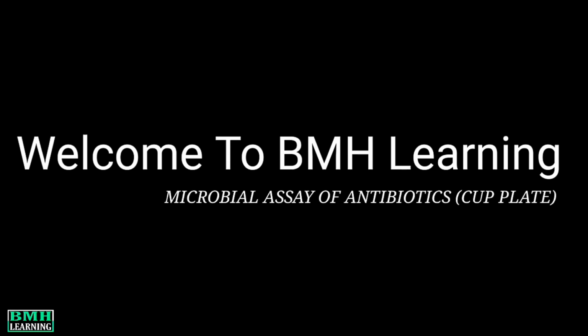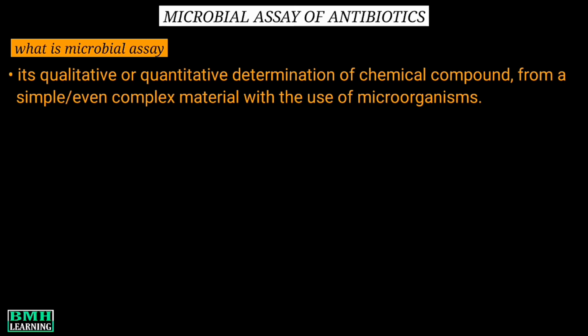In this video, we will discuss the microbial assay of antibiotics by the cup plate method. What is a microbial assay? A microbiological, or we can say microbial assay, is defined as the qualitative or quantitative determination of a chemical compound from a simple or even complex material with the use of microorganisms.